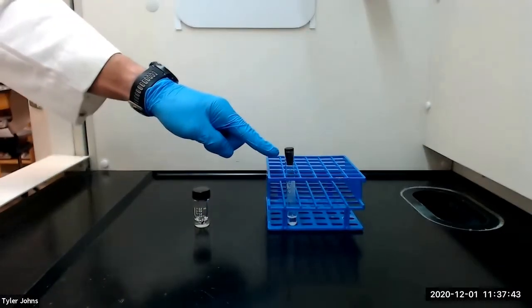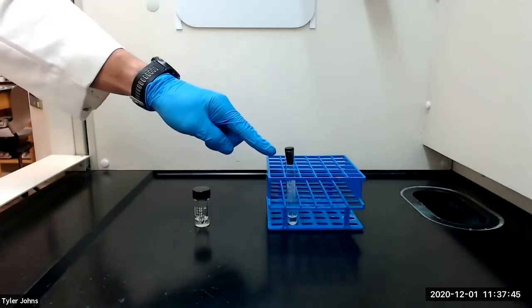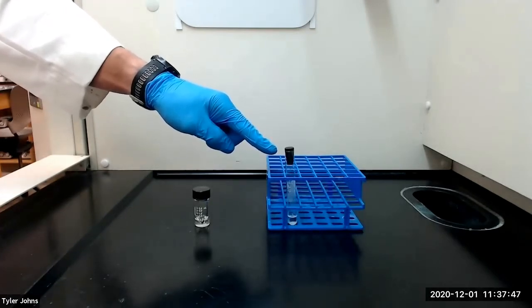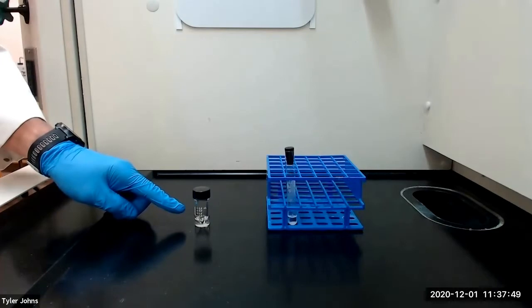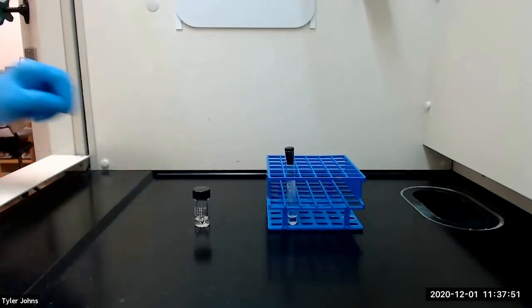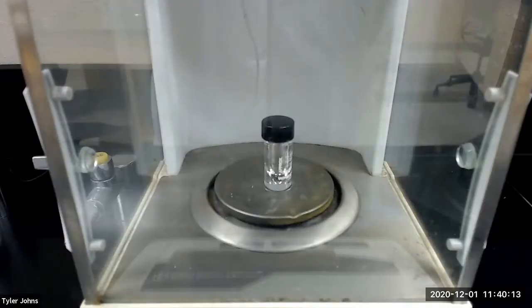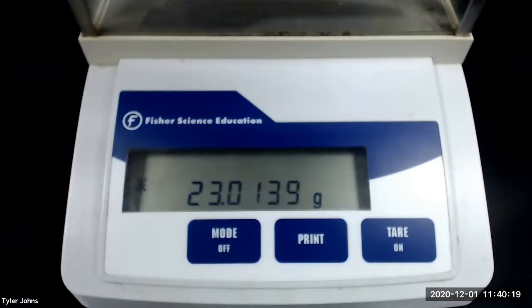While our 4-methyl cyclohexene continues to dry over anhydrous sodium sulfate, we will pre-weigh a new 3-milliliter conical vial. The mass of the pre-weighed 3-milliliter conical vial is 23.0139 grams.